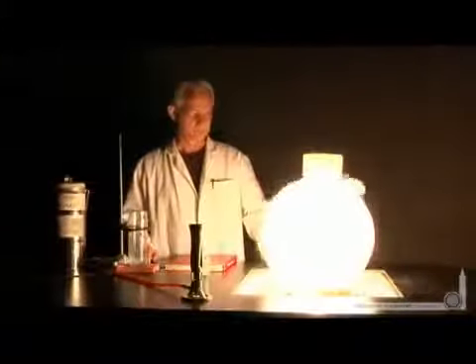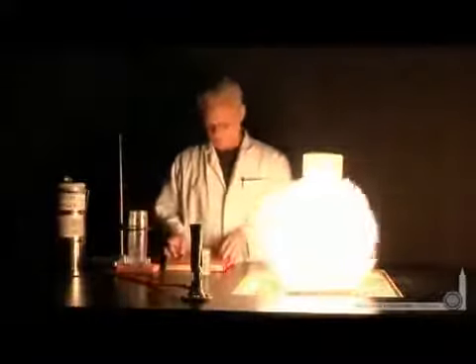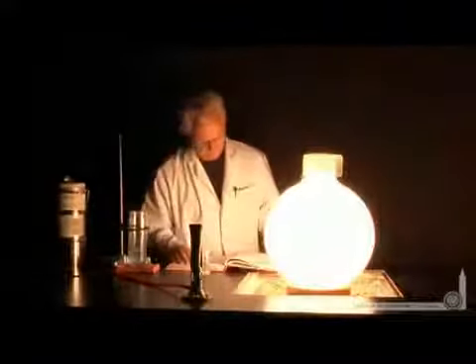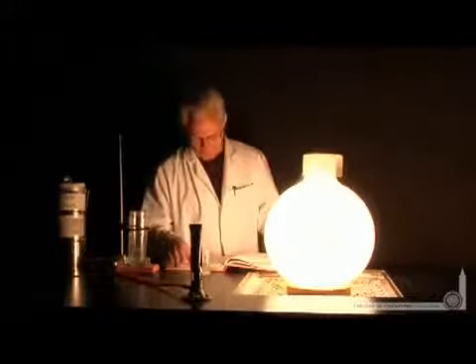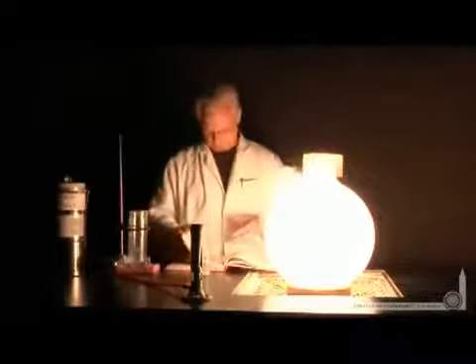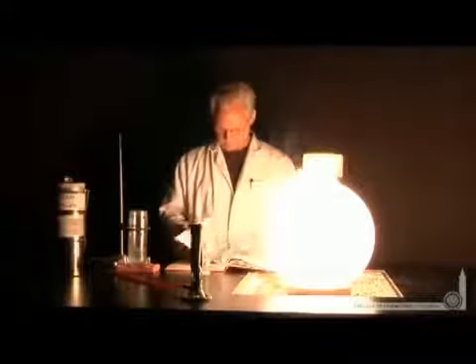When he initiates the reaction, you'll see a tremendous amount of energy released as the phosphorus oxide is formed, and the energy is released in the form of bright light, tens of kilowatts of light, the equivalent of hundreds of 100-watt light bulbs. Lonnie can use the light actually to read from one of his ancient tomes.